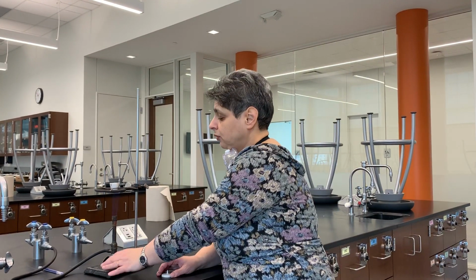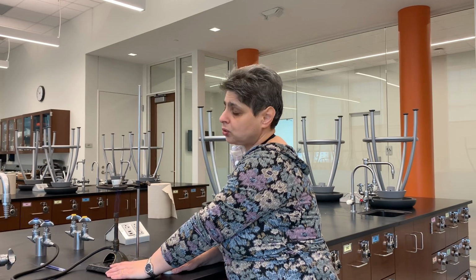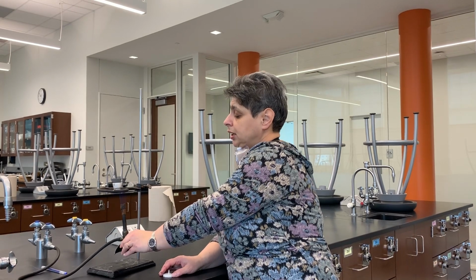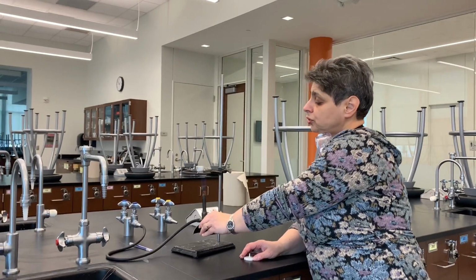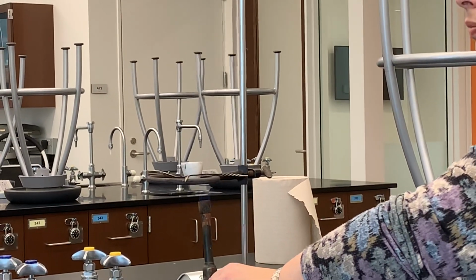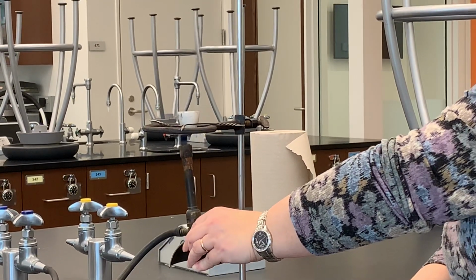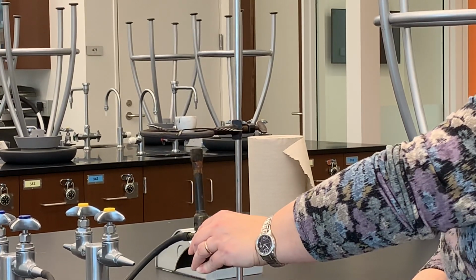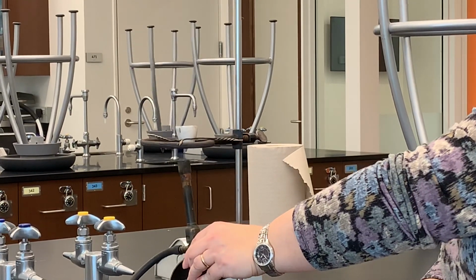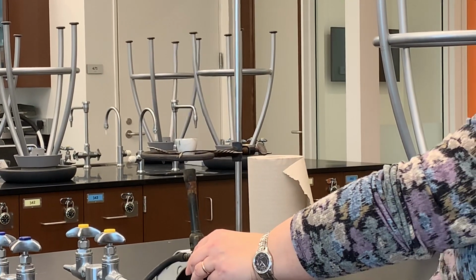I'd like to point out that when you first begin heating a container like a crucible, if you have to do it in the future in any of your courses, what you would do is pick up the burner and carefully rotate it around the bottom of the crucible to ensure that the entire outer surface is heated evenly. This also helps ensure that the crucible will not crack when heated to very high temperatures. Temperatures may reach up to 800 degrees Celsius here. So this porcelain is extremely heat resistant. We may later see the bottom of the crucible turning red. That's how hot it will become.